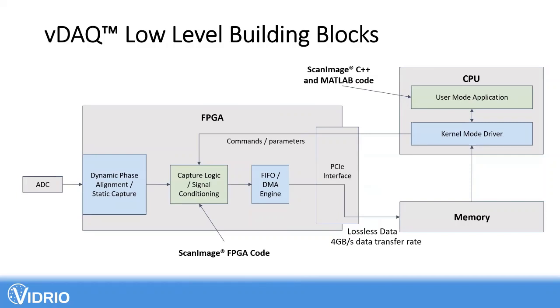This is Jonathan King. I'm going to jump in here. You would absolutely have access to the frame partially as it's being acquired. And depending on whether you implemented some algorithm on the FPGA or in the C++ backend of the ScanImage code, you could have obviously different levels of latency from when the analog signal of the pixel is actually acquired to when you perform some operation on it. But the bottom line is, yes, you can do operations on partial frames.